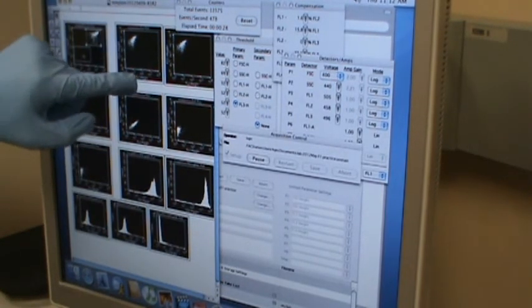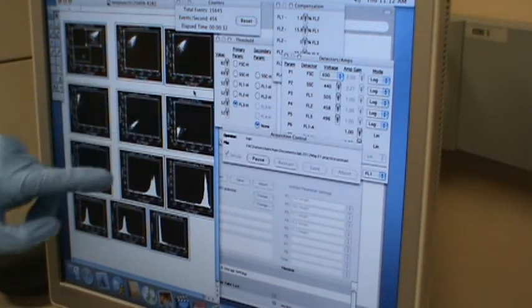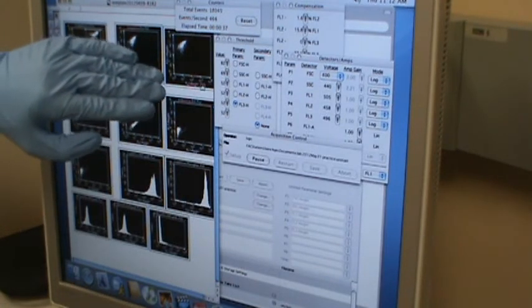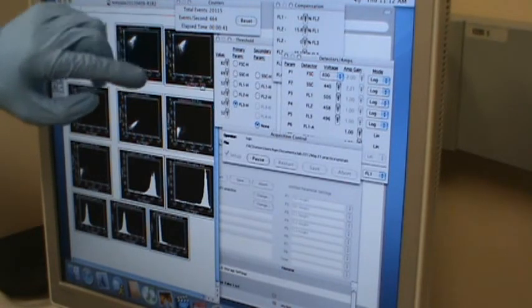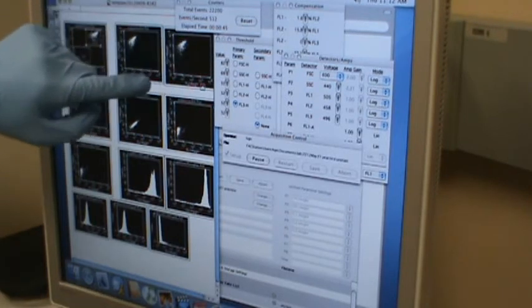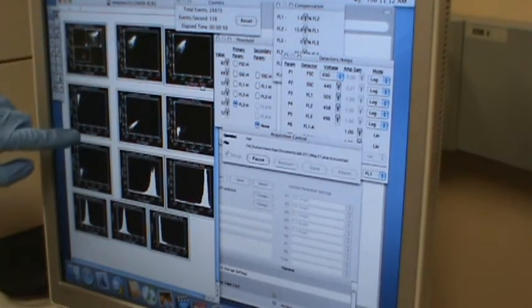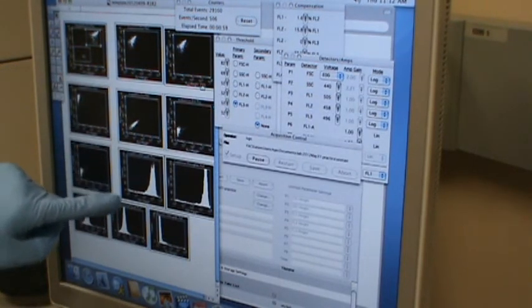That's channel 1. So I have channel 2 and channel 3. In both of the channels you see some signal. You still see some baseline signal. There's no fluorescence. Those are just baseline signals. You still see some baseline signal like 50. This is probably also like 30 or 40. For this channel, the baseline is less than 10. So that's the two-dimensional part.